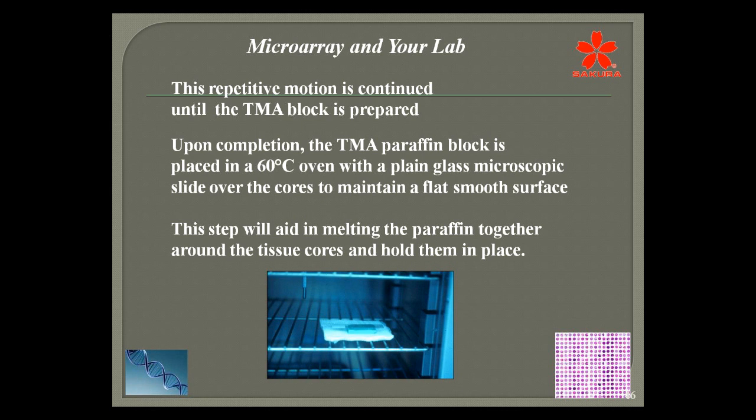You don't want it to stay in there too long. It's hard for me to tell you what's too long because I'm not sure what type of paraffin you're using. You may be using a hard paraffin, you may be using a soft paraffin. So either way, you're going to have to kind of time it. You don't want this to thoroughly melt.